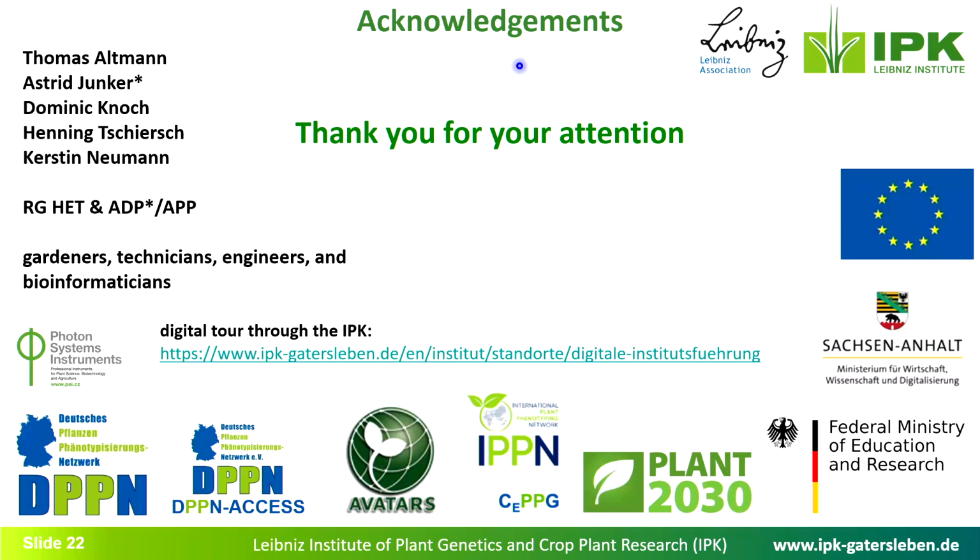Yeah, fungi or maybe weed. So normally we mix all the soil together and then sample from that to ensure that basically every container gets the same from the same sample. So we don't take one inch out of the field and put it in one container. We sample it all together, mix it. And I think also the field soil was steamed.